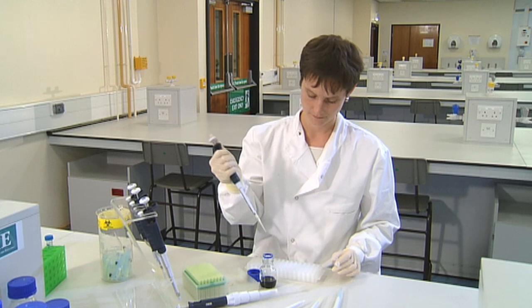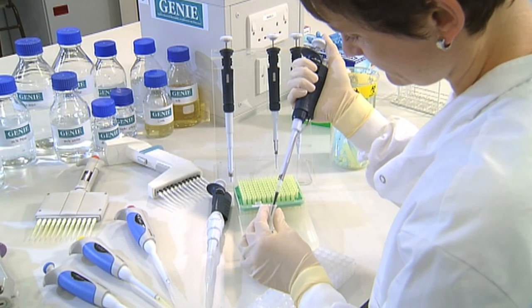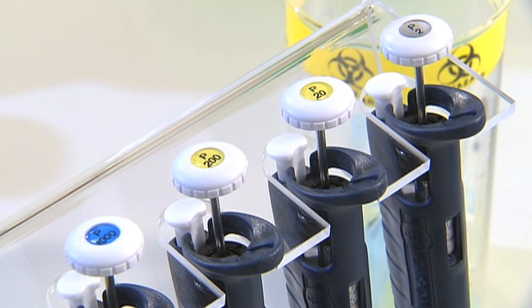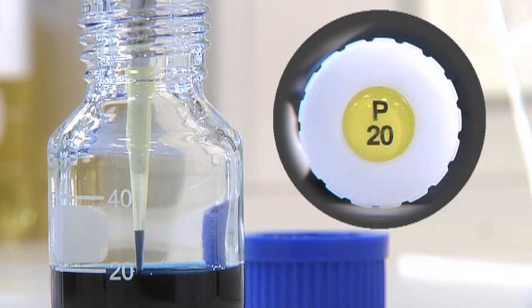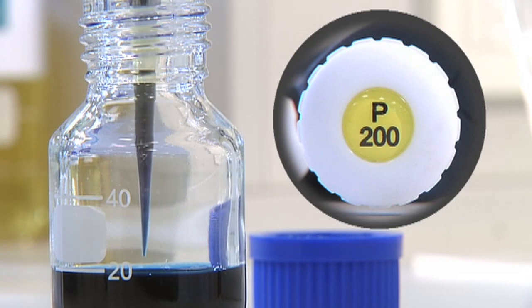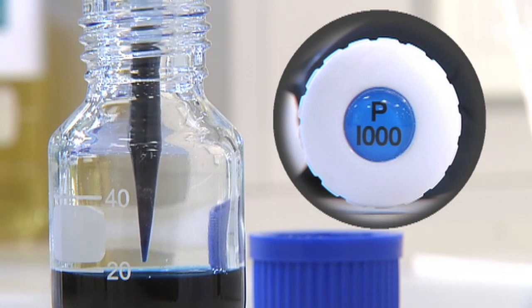Different pipettes work across different ranges of volumes and are named by the maximum volume they pipette. They're labelled on the top of each push button with a capital P followed by a number indicating the maximum volume. A P20 pipettes between 2 and 20 microlitres, a P200 between 20 and 200 microlitres, and a P1000 between 100 and 1,000 microlitres.